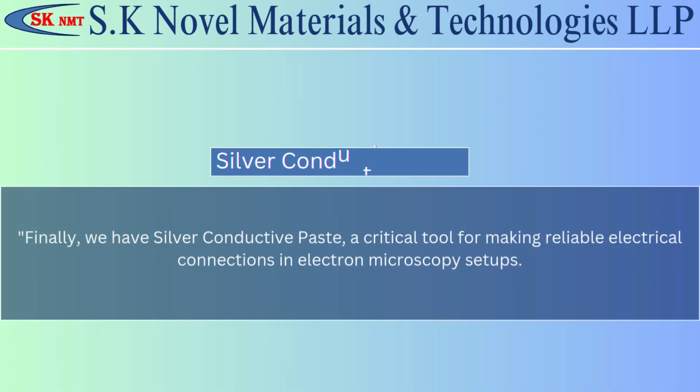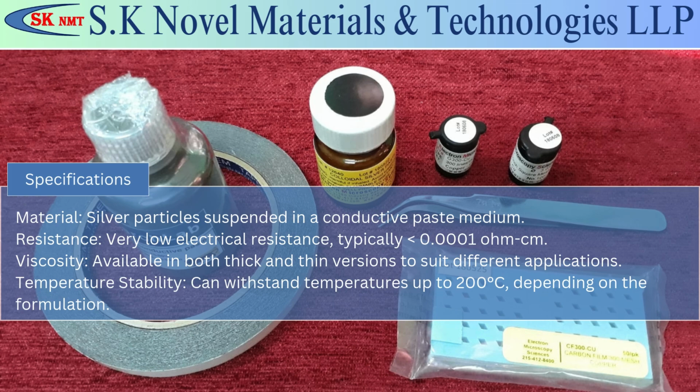Silver conductive paste. Finally, we have silver conductive paste, a critical tool for making reliable electrical connections in electron microscopy setups. Specifications. Material: silver particles suspended in a conductive paste medium.